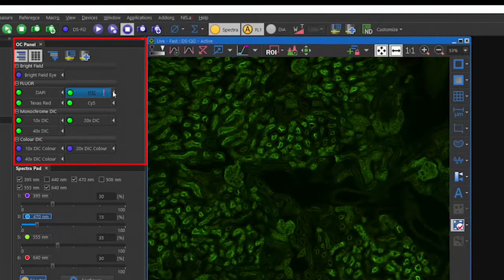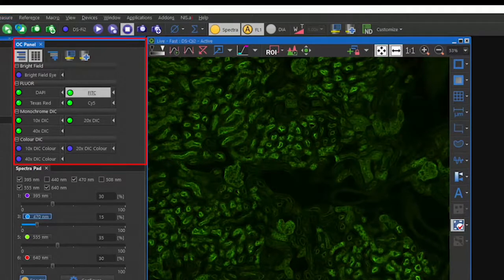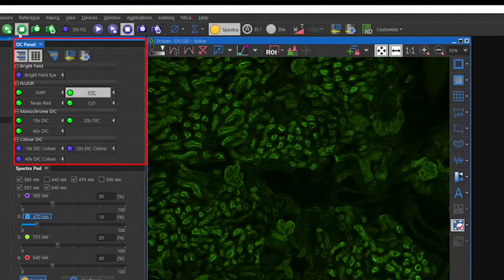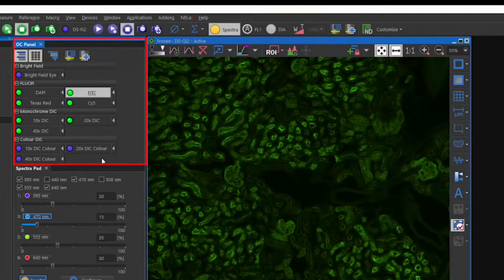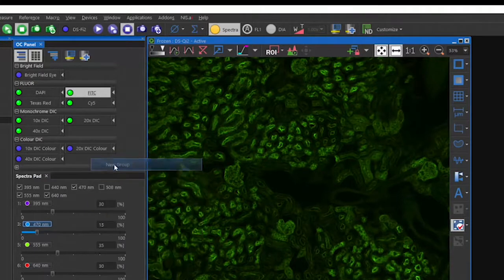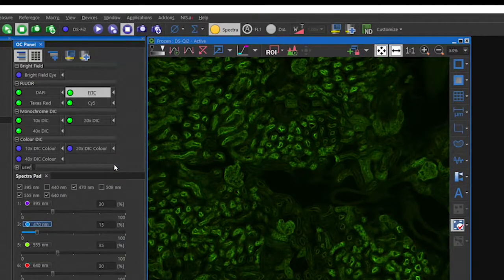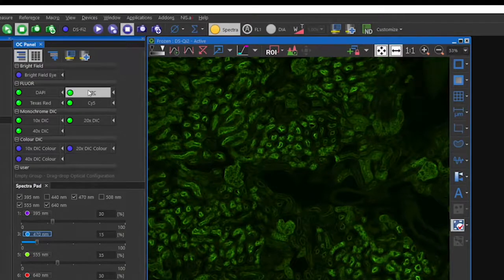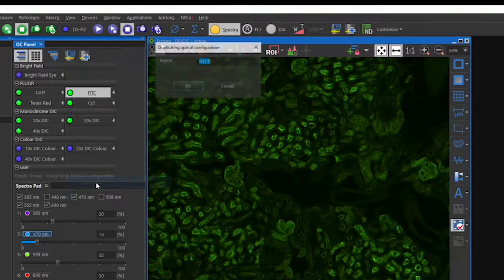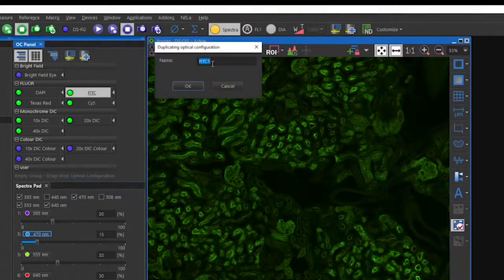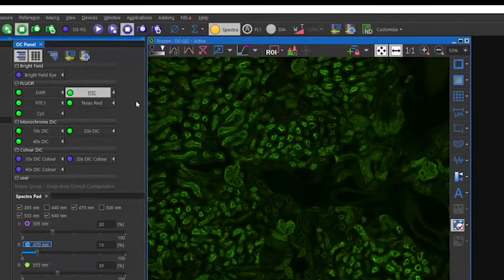Then create your own group and duplicate the OC and move it into your group. Now you can reload the default OCs which will put the original settings back into FITC, without changing your optimized settings in FITC1. We always recommend keeping your OC separate from the default OCs. So if you make a mistake, you can reload the default OCs using the macro button and start over.